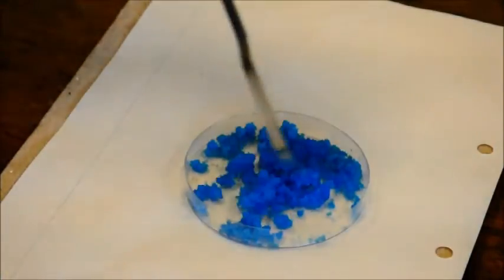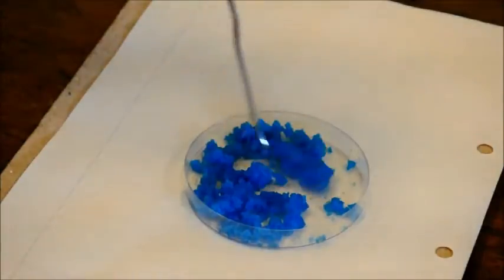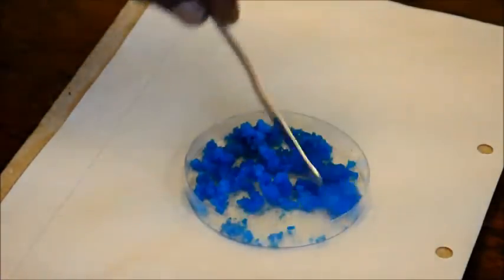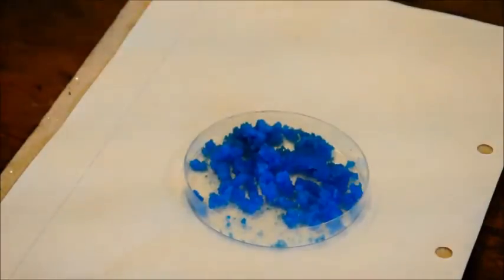They do contain some water of crystallization, and that's why they are blue. If we were to heat them strongly on a flame, we could drive off that water, and what we'll be left with will be anhydrous copper sulfate. But this is what we make from this reaction.